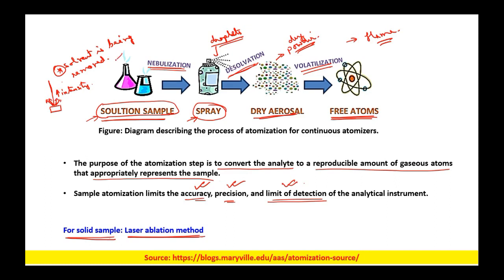So there is no need for such a long process in the laser ablation method. In laser ablation, we basically convert a solid sample directly into gaseous atoms.